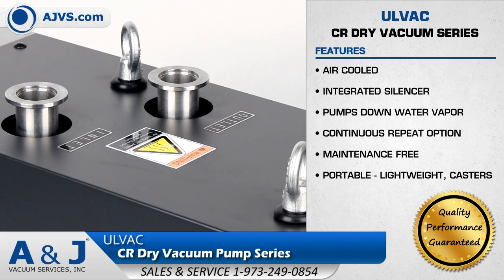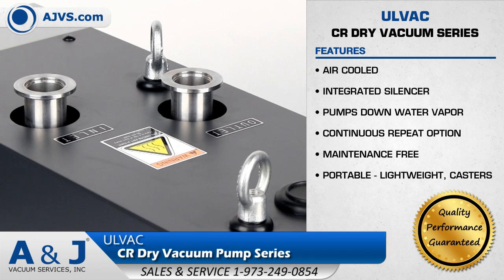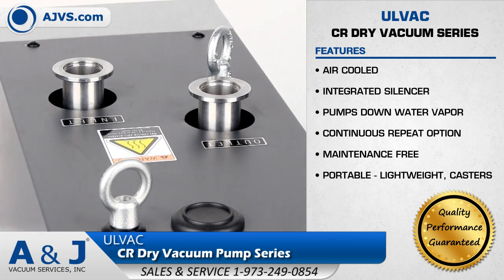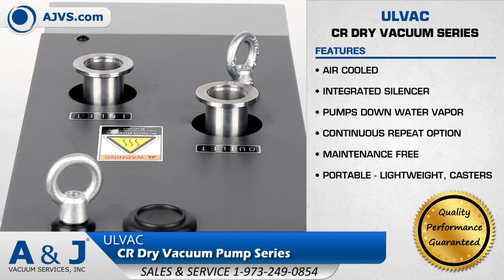The Olvac CR series is completely oil-free and suitable for pumping dry and non-corrosive gases. The CR pump is also able to pump down water vapor with the use of a gas ballast.